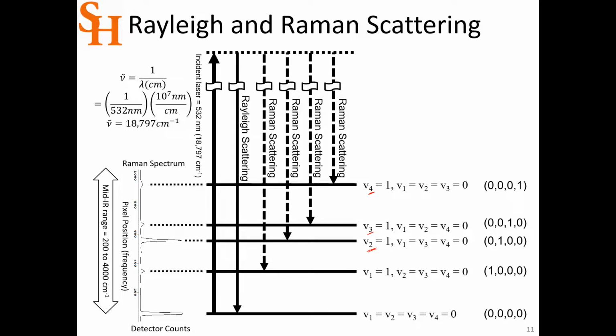And so you can add a constant to the whole spectrum and just shift it up a little bit. And you can put all 4 on the same plot, stacked by these constants. And so every spectrum will be normalized, 0 to 1, and stacked, maybe 0.5 to 1.5, or 1 to 2, or 1.5 to 2.5. And so when you plot all 4 of those on top of each other, then you can see this is the Raman spectrum for chlorobenzene and the Raman spectrum for benzene.